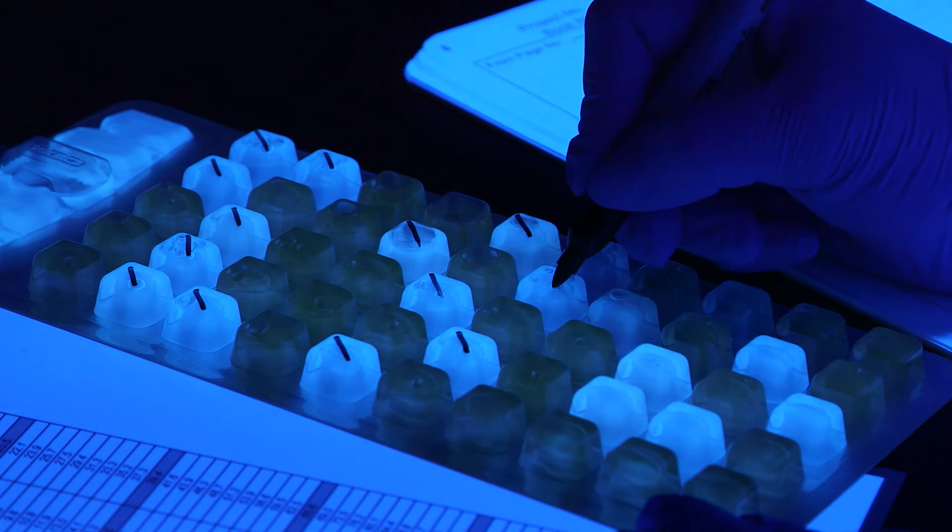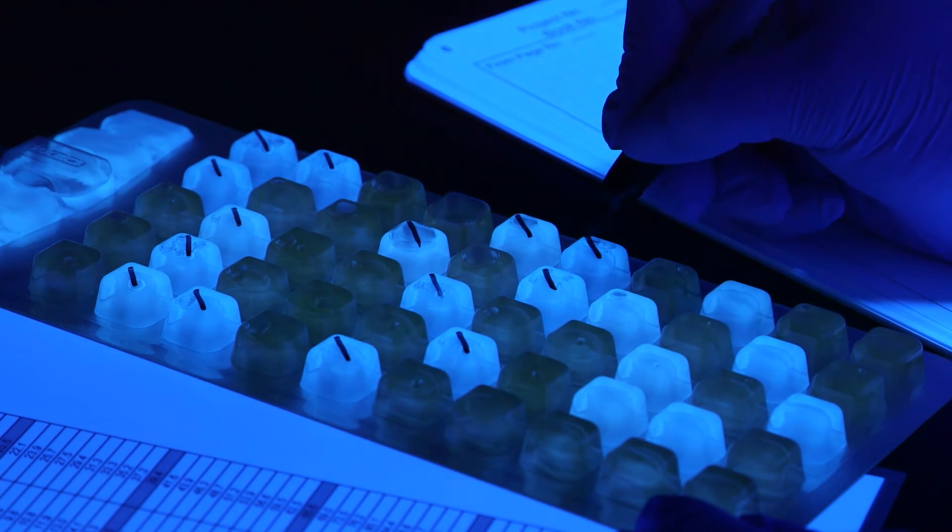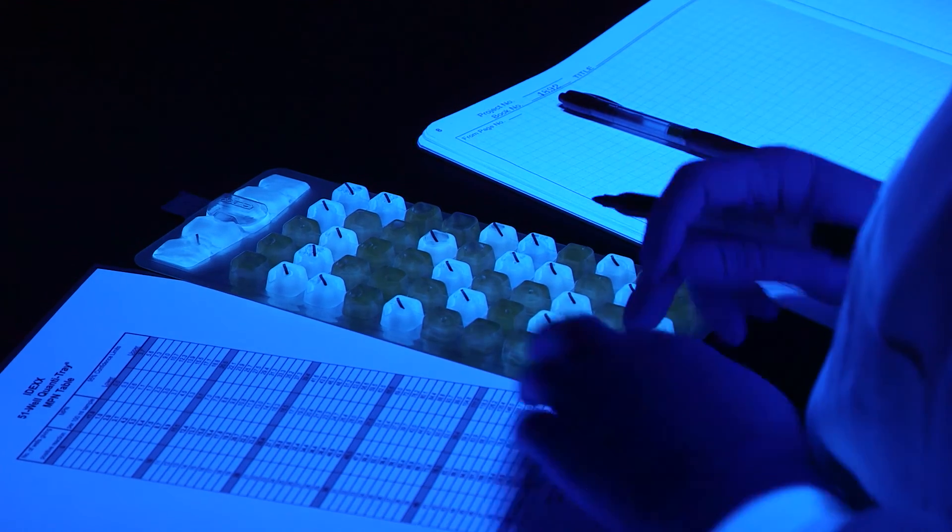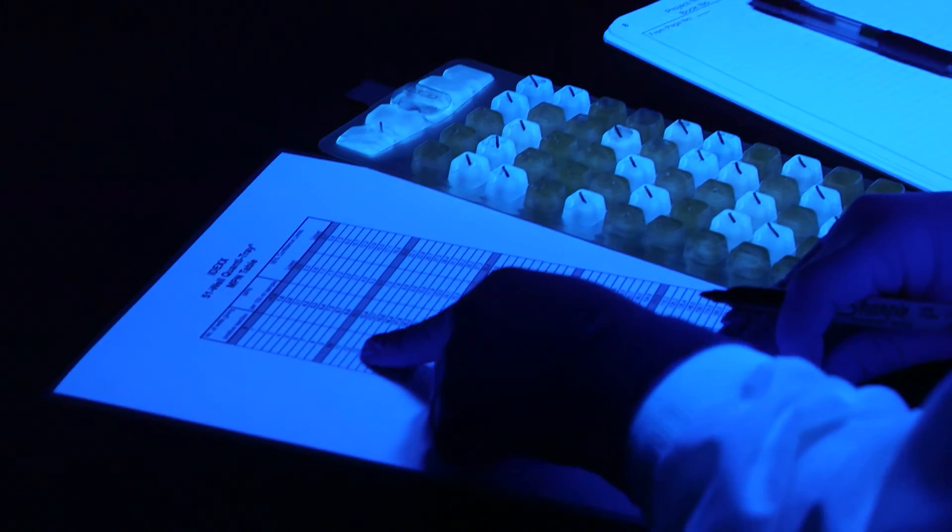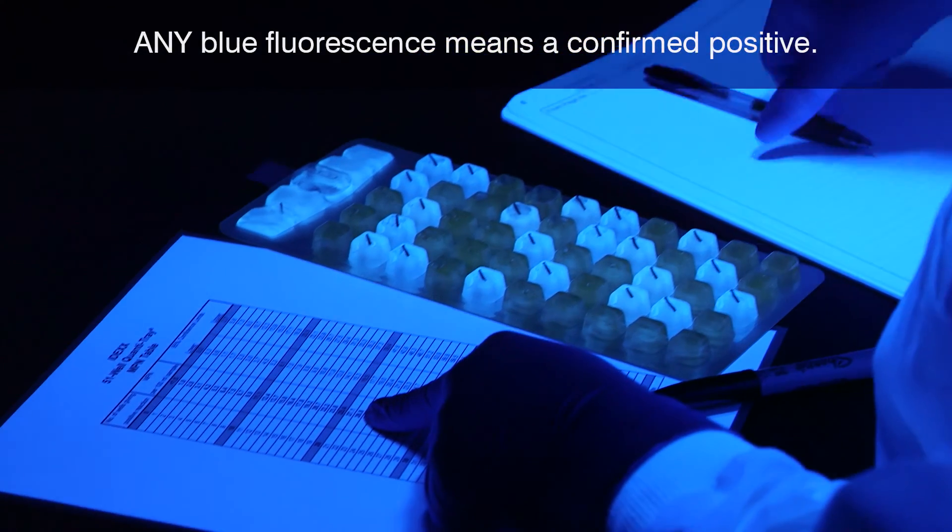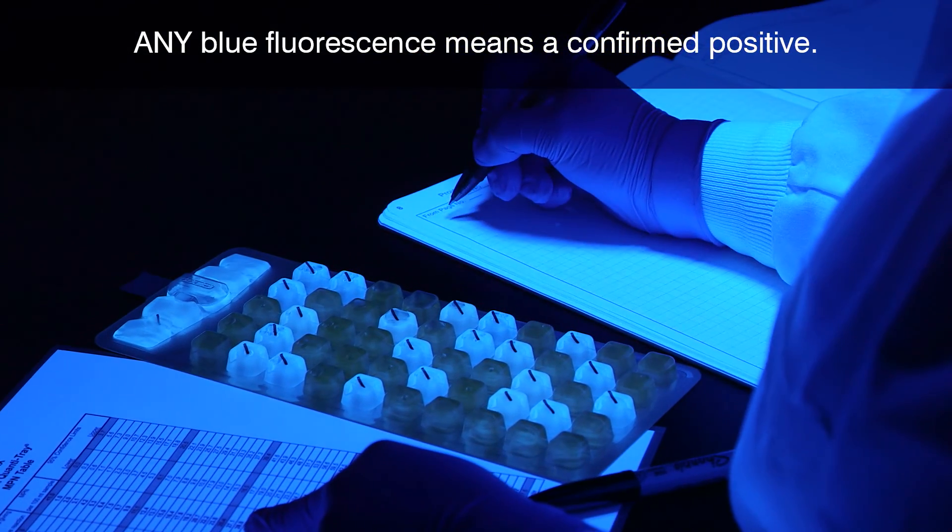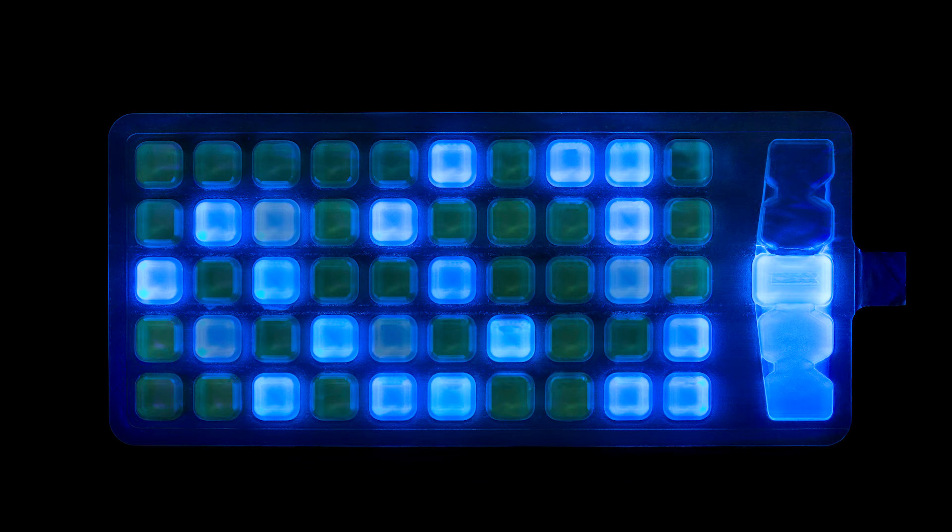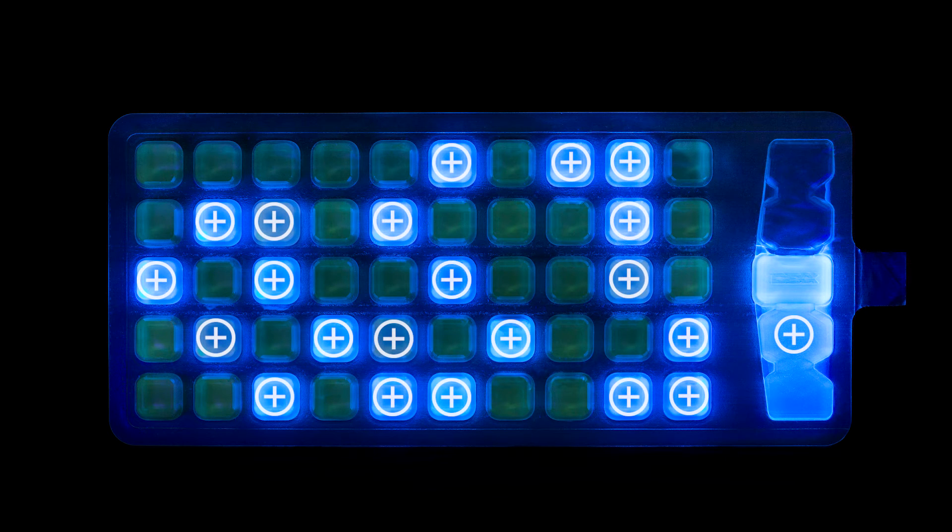Count the marked wells and then refer to the MPN table included with the Quantitrays. The most probable number for this example is 28.8 per 100 ml. If using Quantitray 2000, count the overflow well as a large well. Any blue fluorescence means a confirmed positive for enterococci. Here is an example with both strong and weak fluorescence. There are a total of 22 fluorescent wells.